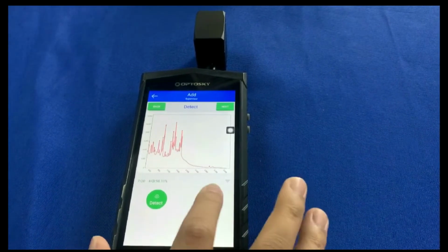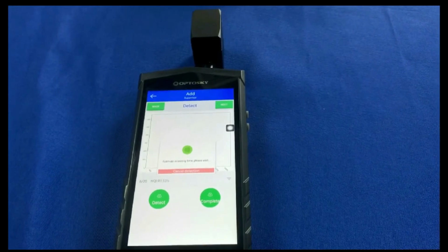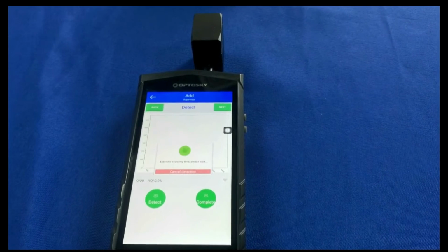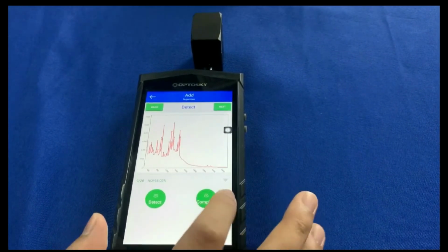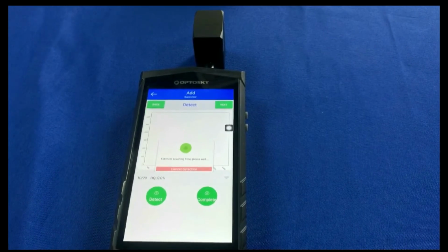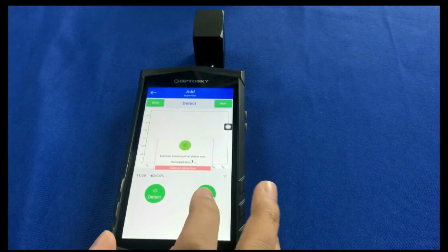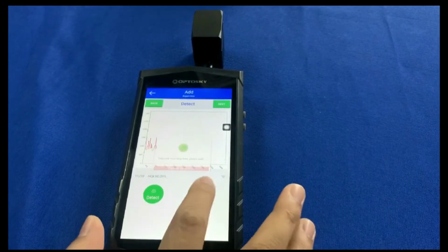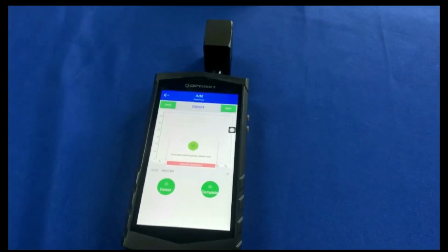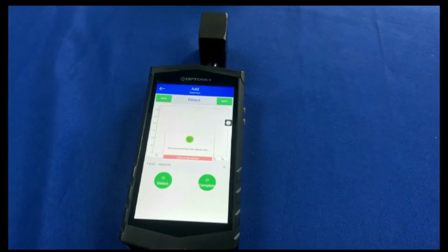After we perform this, usually we use paracetamol with different batches of raw materials. Such as if you have purchased many batches of paracetamol, you need to scan all these batches to save a method.